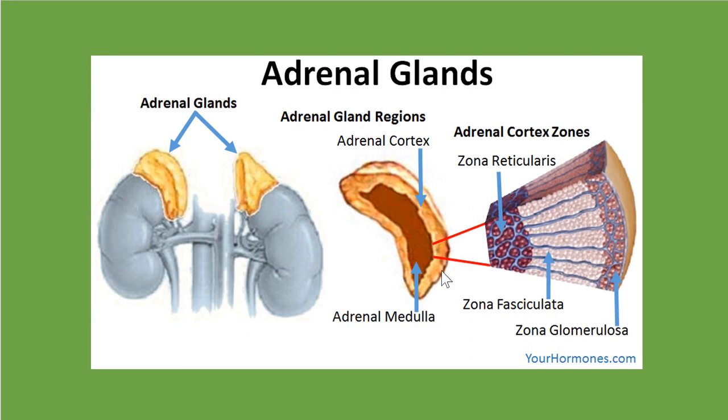Now, we're going to have the adrenal cortex, which is going to be the outside, and the medulla. A lot of AP2 histology in terms of cortex and medulla comes up a whole lot. I don't know if I remember it much from AP1, but I could be wrong in that. But in AP2, I feel like there's a cortex and medulla to everything. So in the cortex, and it's showing you just a small section of it, is where you're going to see the 3 zones.